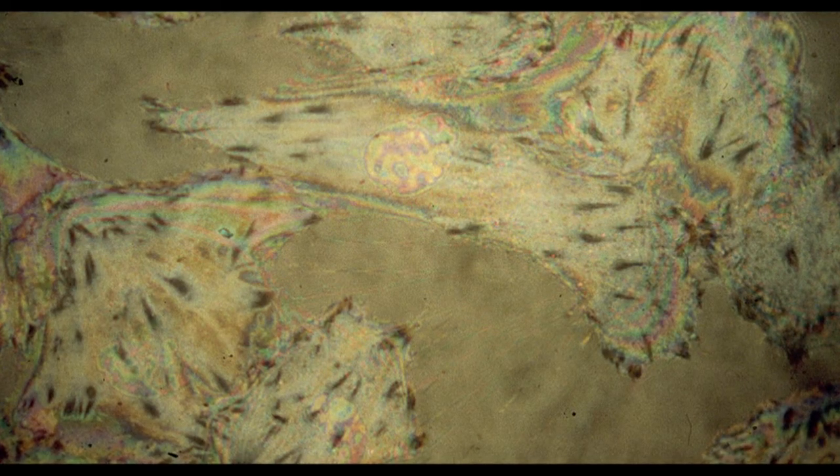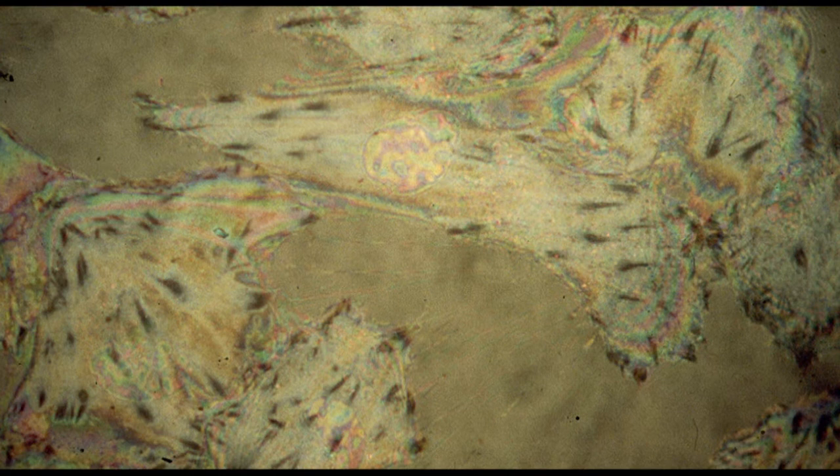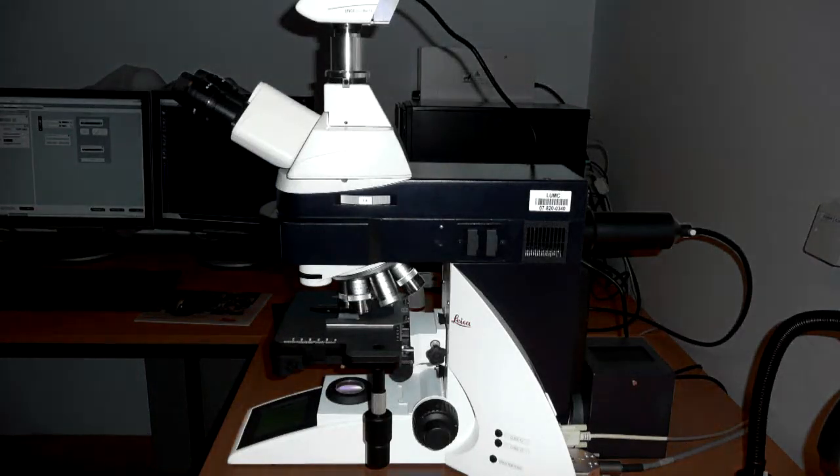Studying living cells was the first application for RCM. In an aqueous environment, the cell glass contacts are the less reflective, darker contact sites, so movement can be studied. RCM is performed on a microscope with incident light instead of transmitted light. RCM images can also be produced with a fluorescence microscope adapted in such a way that only the reflected light from the surface of the specimen forms the image.